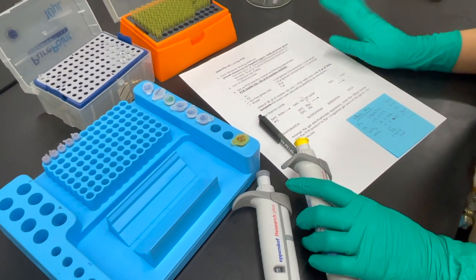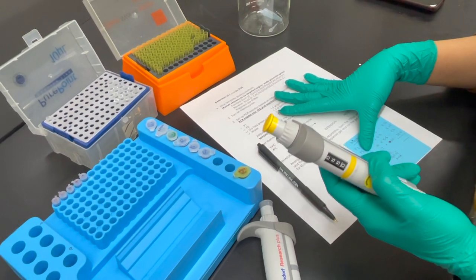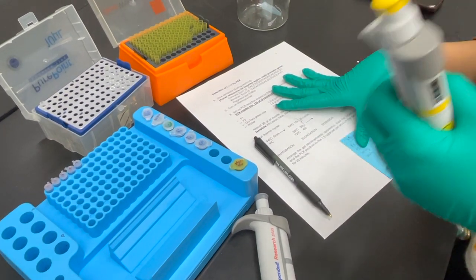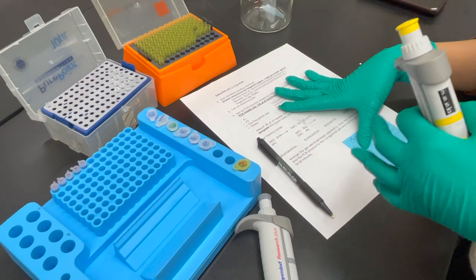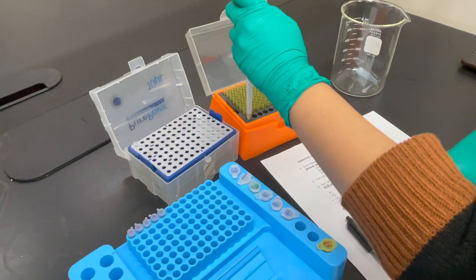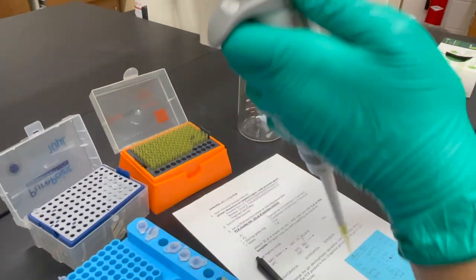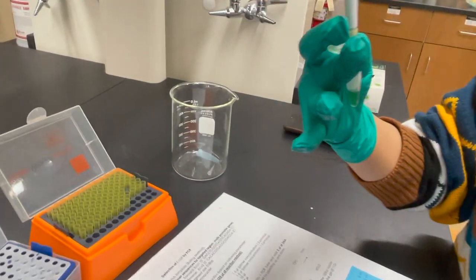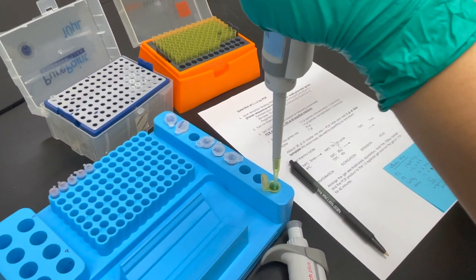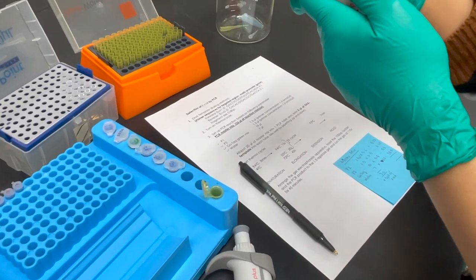To prepare our master mix, we have all our reagents here. We add the GOTAC master mix first — the green reagent containing MgCl2, dNTPs, and all the required reagents for PCR. We need 55 µL of GOTAC, which we transfer into a new tube that will hold our master mix solution. Next, we add 38.5 µL of water.